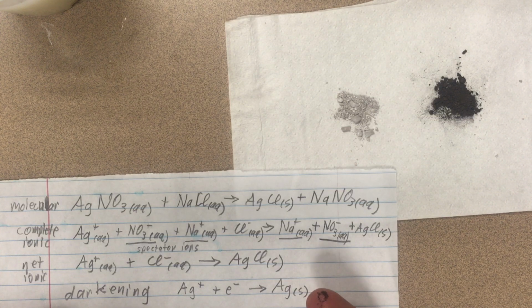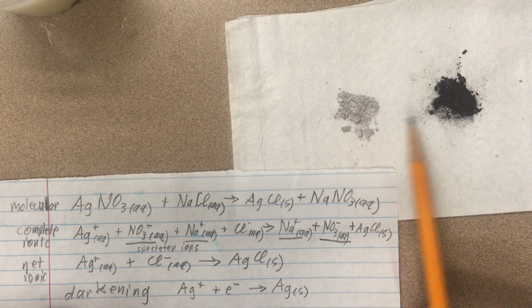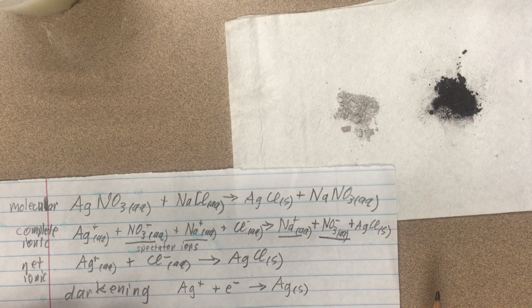In fact, I got a little silver solution on my finger. You can see how it's dark on the tip of my finger where that solution darkened. But here we have ultraviolet light darkening the silver ions to produce silver metal. You can imagine how these types of reactions might find use in photography.